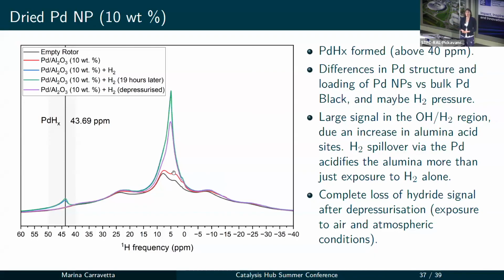And we wouldn't be averse to looking not just at palladium, but at a mixture of different metals alloying with something else. If it's a metal which is also easier to study by NMR, that would be great, because palladium is not really something that we'll be able to look at. But if you alloy it with something else, then we could also have the NMR side in the nanoparticle, which would be interesting. So I'm definitely open to exploring that further.